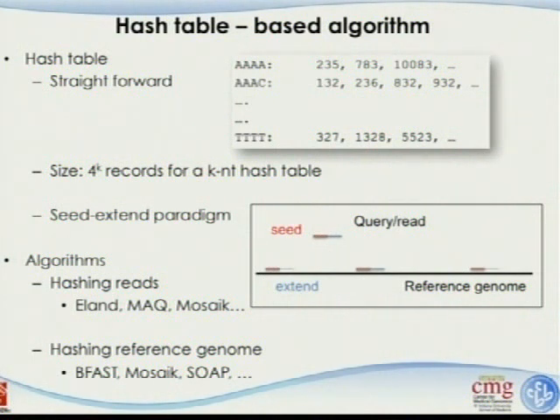Some of them are very widely used. There are two sub-strategies. The first one is indexing the read. The other one is indexing the genome. To index the read, the most famous one will be the ELAND algorithm. And I'm not going to talk about that because we are not allowed to talk about that. Not really, but we don't know the details. It's commercial software, and they never published their algorithm. And that is the one that Illumina was using very initially.